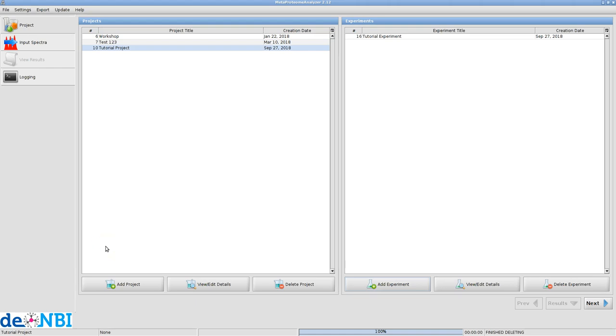Welcome to the MetaProteomeAnalyzer tutorial. This tutorial will deal with how to perform protein database searches.